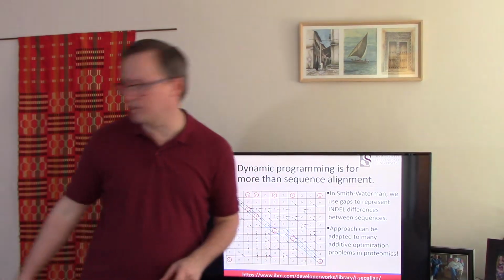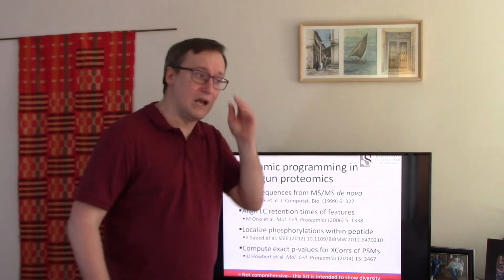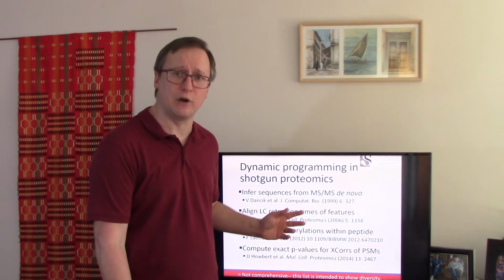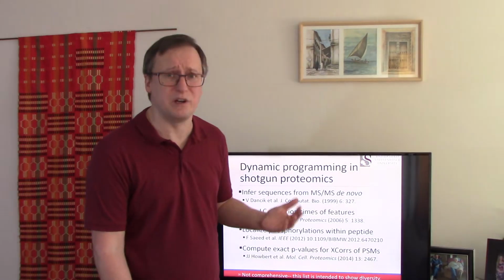How does any of this have to do with proteomics, though? I thought it would be worthwhile to talk about a few examples of dynamic programming as used in shotgun proteomics, because it's actually pretty ubiquitous.